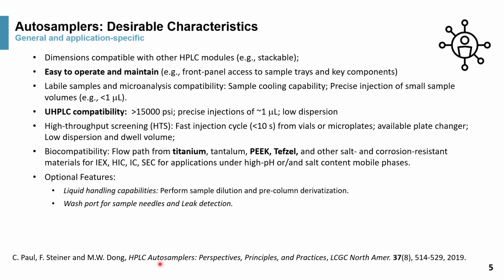This table spells out some of the autosampler desirable characteristics, and some are general, some are application specific. Once again, we highlight a couple of them. They should be easy to operate and easy to maintain. Most of them have front panel access to the sample tray and also access to key components.